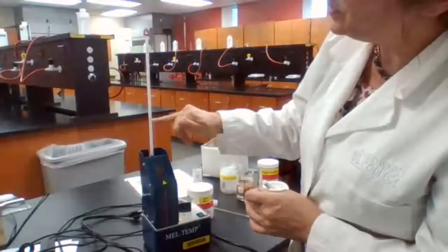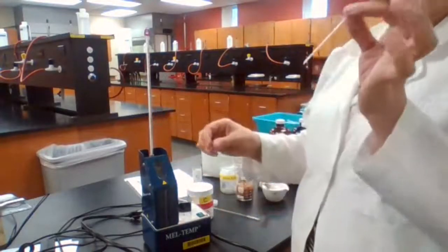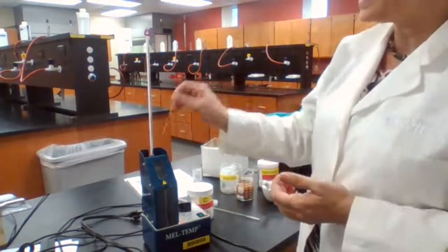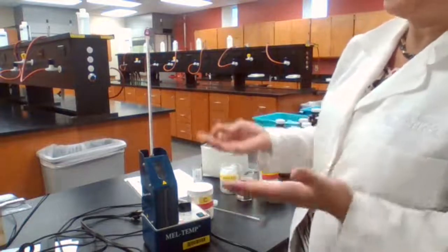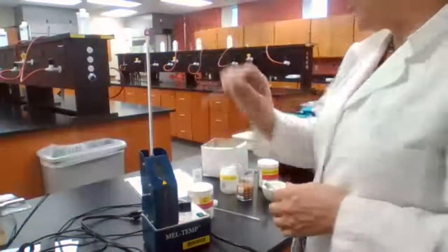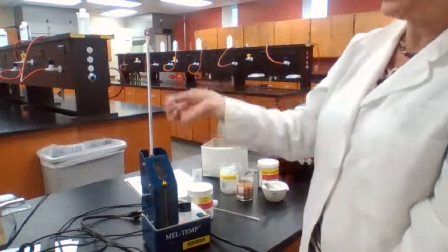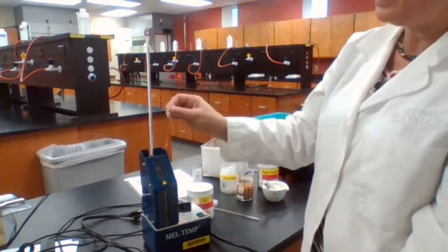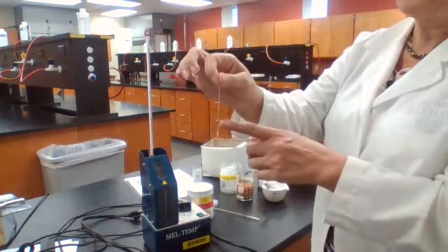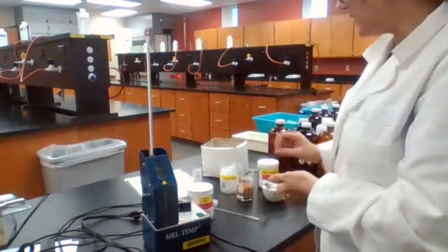So the starting temperature on the thermometer should be at least 10 degrees less than the melting point of the sample. Otherwise, as soon as I put it in, it melts, and I don't know what the melting point was. So this was not a good technique, since it's unknown and I didn't know the melting point. I did a quick melt. Because it was too hot, I took out the sample. Not a valid number. I'm leaving it here to dispose of later.